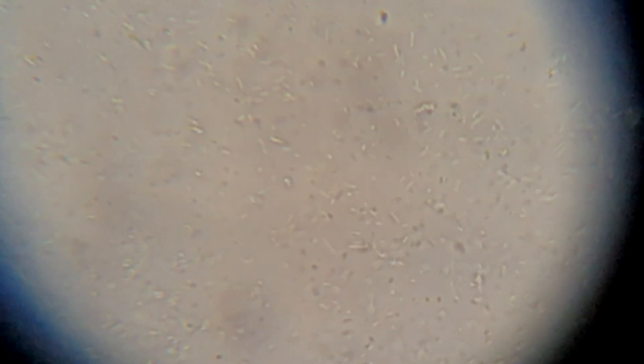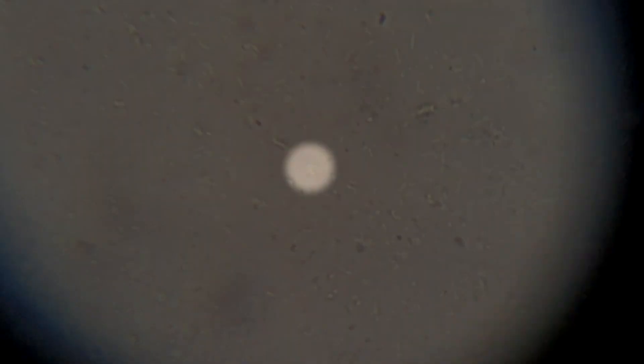Here you are observing the normal Escherichia coli, the beneficial one in your intestine. See how they are moving.